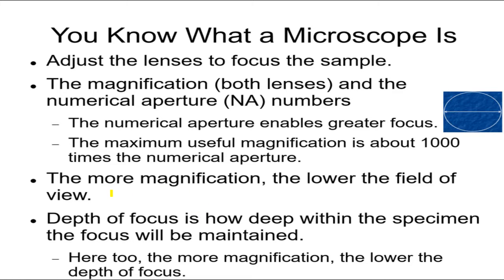The things that are a little bit more understandable, that I can go into a little bit more, would be the magnification compared to the field of view. Now, you might think that if you just increase the magnification, you'll get more information, but that's not so simple. Imagine you are trying to magnify, let's say, a needle held in your hand. If you have a low magnification and you want to see how the fingers are holding this needle, you will have a large field of view.